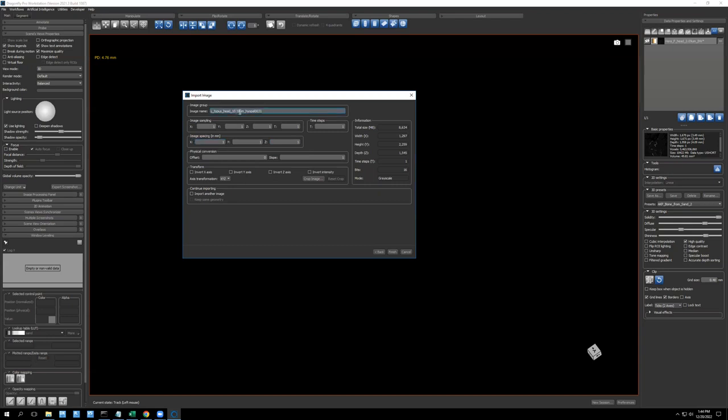When you have your resolution in your file name, you change the image spacing to that, and 10 microns is 0.010. How precise you are depends on what you're doing. I would just do 10 instead of 10 point. The unit there for some reason is millimeters, and I don't think it can be changed.